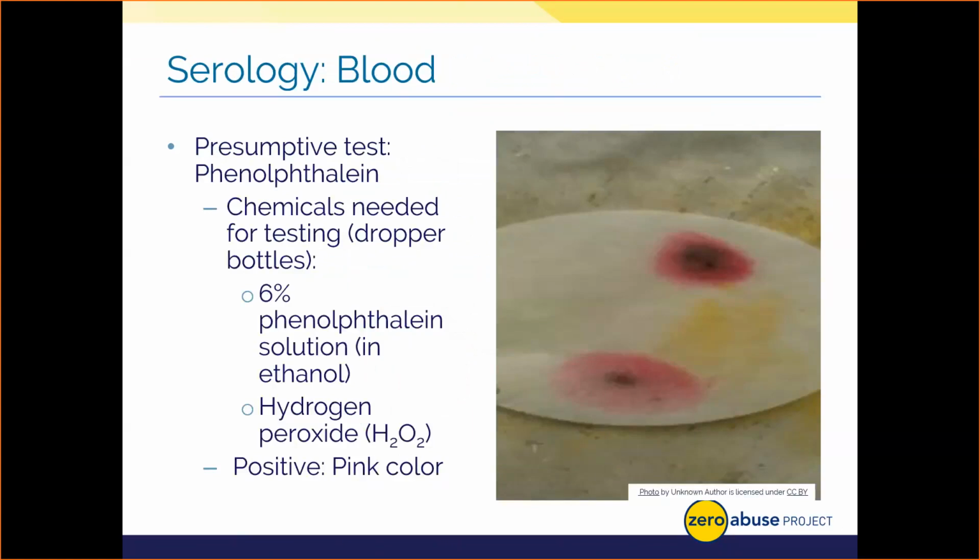Now, some labs might also call this the Kastle-Meyer test, if my terminology is confusing to you. The reagent of the phenolphthalein test targets heme from hemoglobin in blood. Hemoglobin, just to take you back to your high school biology education, is actually the oxygen binding component in red blood cells. Please note that heme is not exclusive to humans, so we cannot assume that blood detected is human blood. Thus, phenolphthalein tests for blood of any kind, and it doesn't tell us whose blood was shed. It could be the suspect or victim or even an animal, for all we know, using this test.